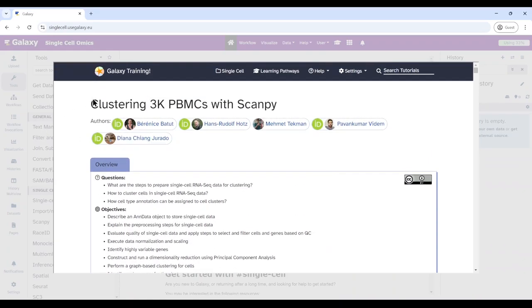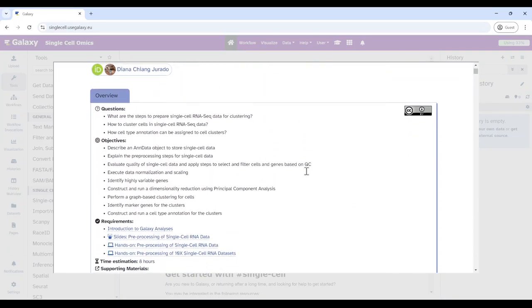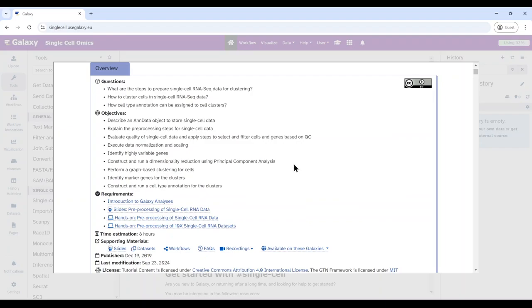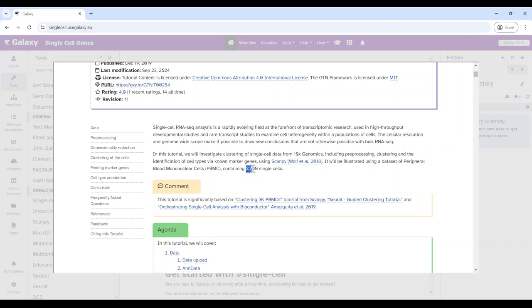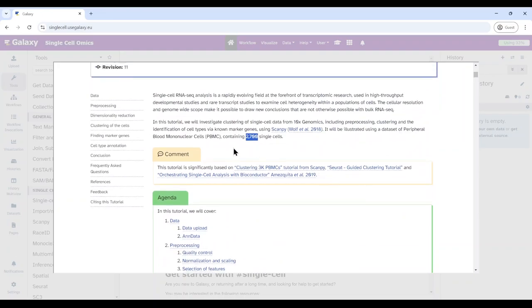As the title says, it's clustering 3K PBMC cells with ScanPy. ScanPy is a Python tool suite, which is one of the popular tool suites for single cell RNA sequencing analysis or single cell data analysis in general. The dataset we are using is PBMCs — it's supposed to be 3K, but actually it contains 2,700 single cells.